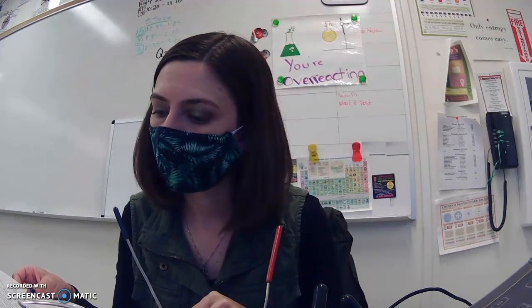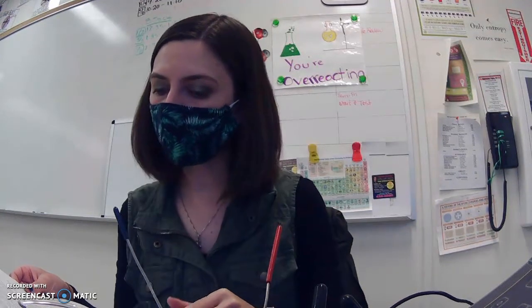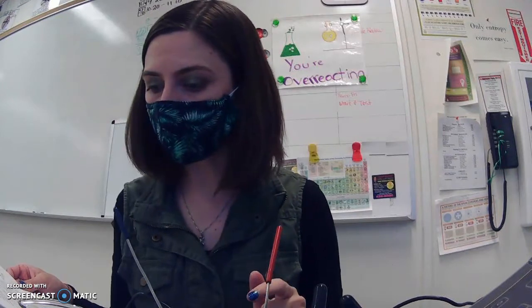So that one is saying that we have electrolytes in it. So it's lighting up as electrolyte. We wash it off. We're going to try the sugar solution and see what we see.